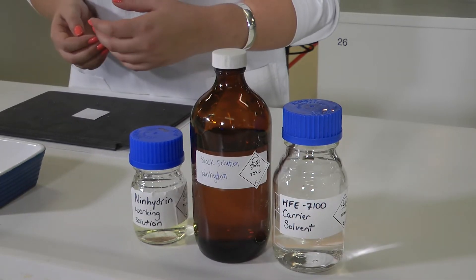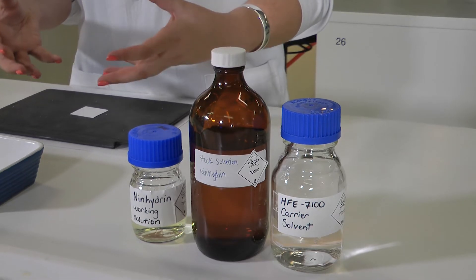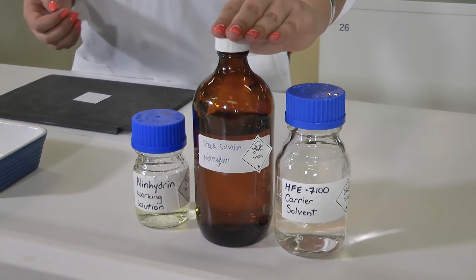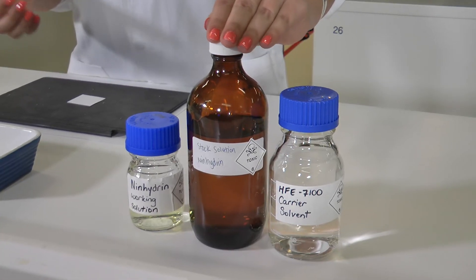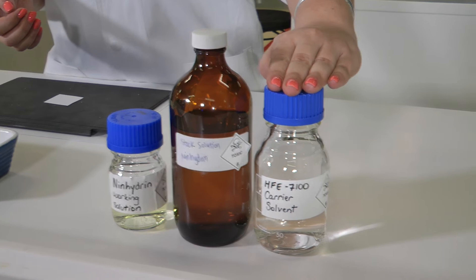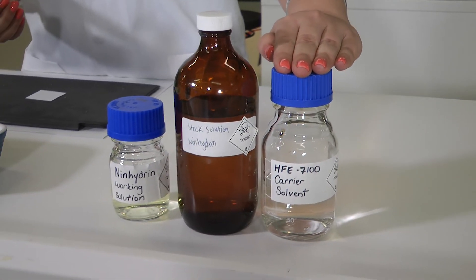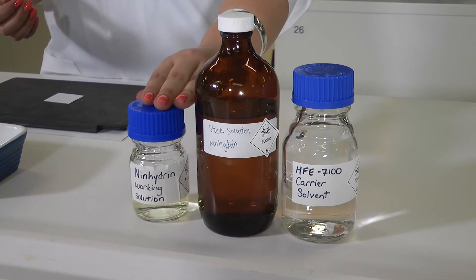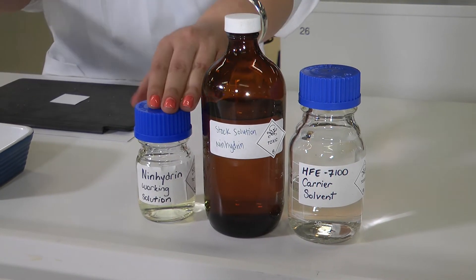To develop anything with ninhydrin we need to get it into a liquid so we can soak our evidence items in it. Here we have our ninhydrin solid dissolved into some different solvents to make our stock solution. We then mix our stock solution with a carrier solvent in a prescribed amount to get our ninhydrin working solution. This is what we're actually going to soak our evidence item in.